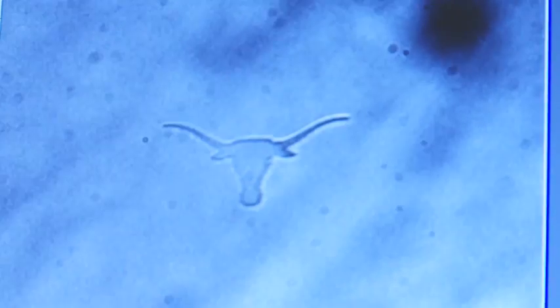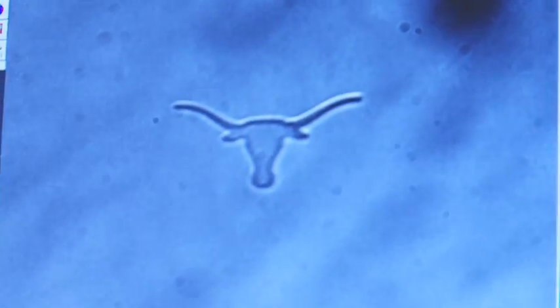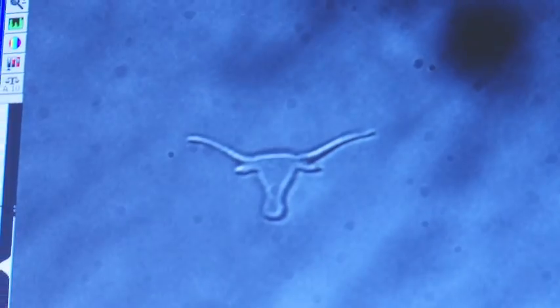Here we have a Bevo, or a Longhorn, made out of bovine serum albumin. The actual size of this is less than 10 microns, which is less than half the width of a human hair. It's truly microscopic.